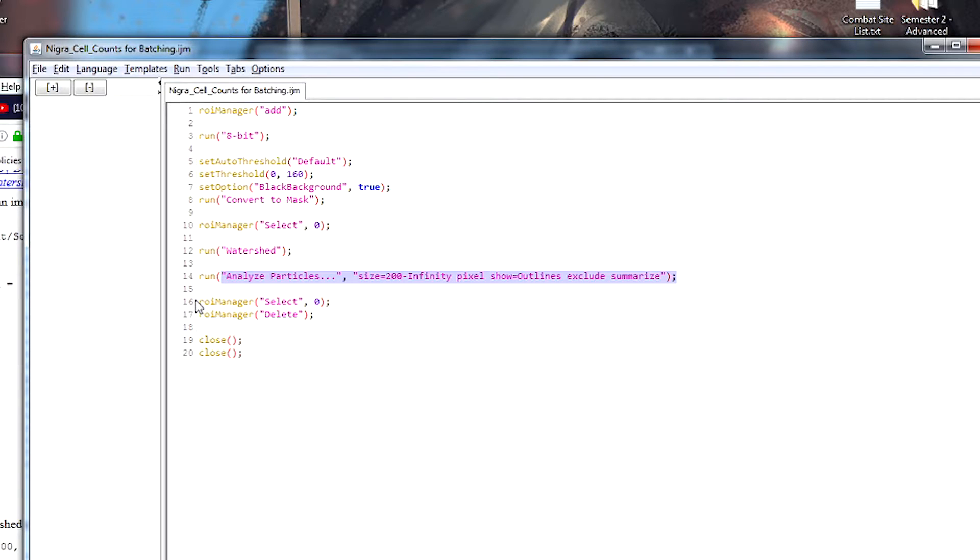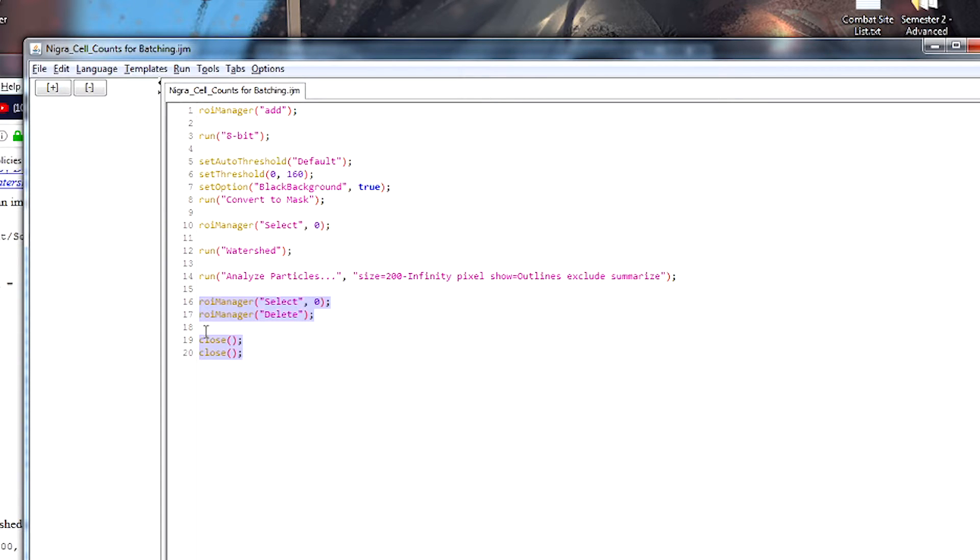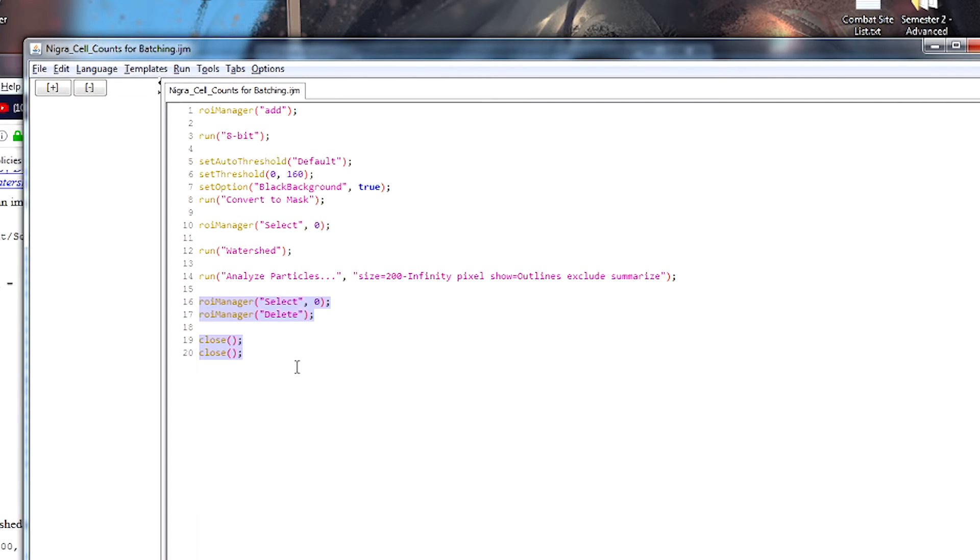Now these last functions reset ImageJ ready for the next image. So first of all, we select the region of interest, which was entered into the region of interest manager, and then we delete it. So that way the region of interest manager is ready for the next one. And then we close each of the thresholded images that were generated when ImageJ was creating and analyzing that first image.